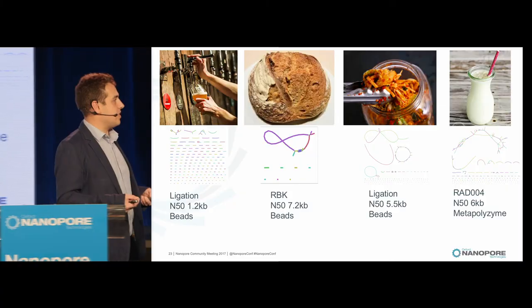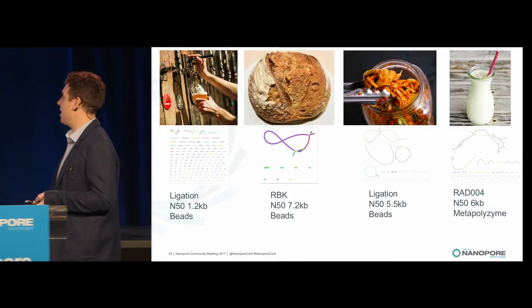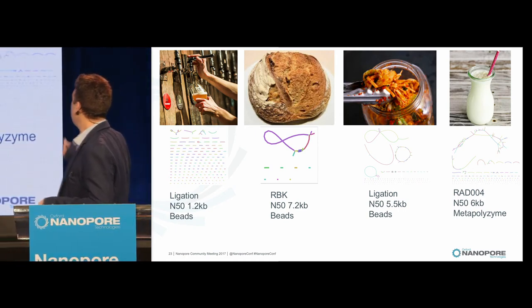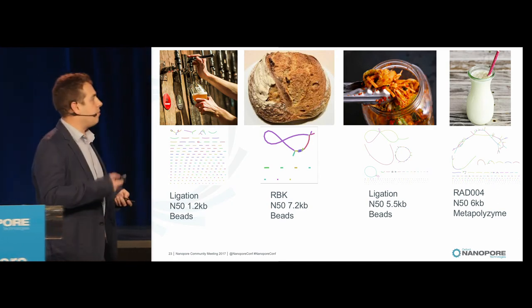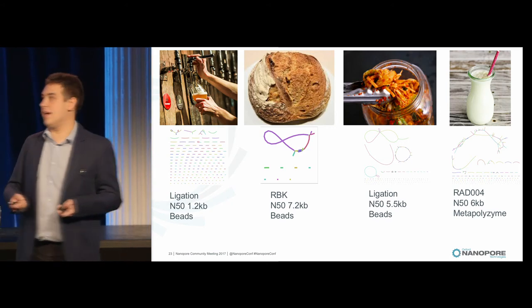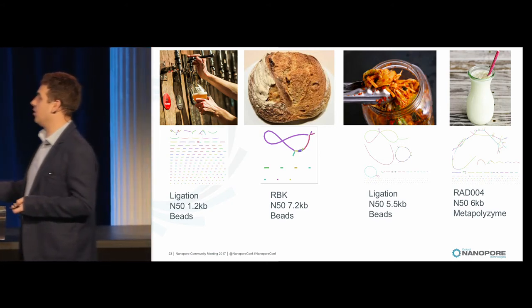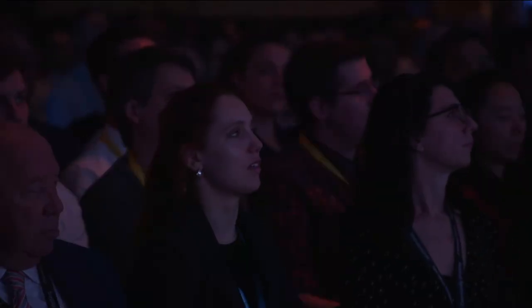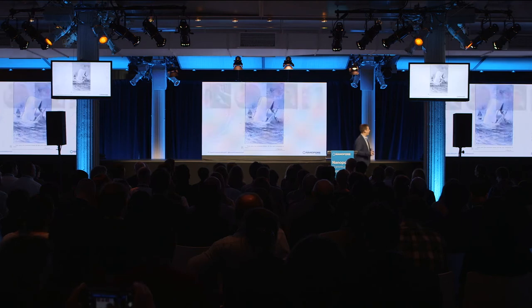Often we get misassemblies and we get mixtures and we get longer genomes than we're expecting because strains get mashed together. But for things like kimchi and kefir here, we are managing to generate three or four, five decent genome fragments, contigs, directly from these ingredients, and we've been playing around with different conditions. But at the moment, we've really got a pretty low N50 compared to where we need to be if we're going to genuinely sort out polymicrobial infections and microbiome samples.